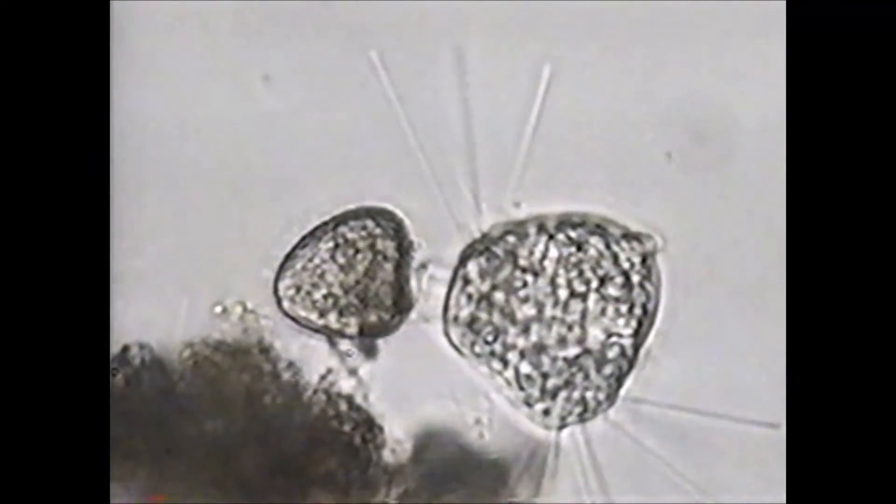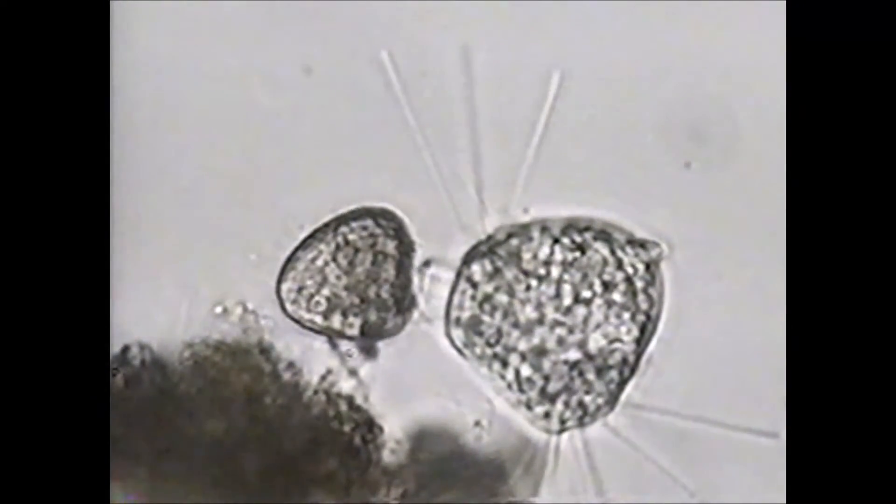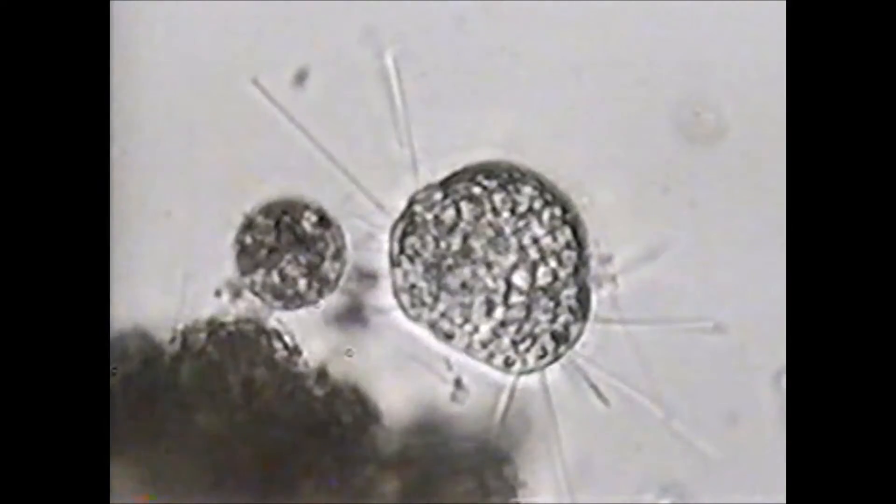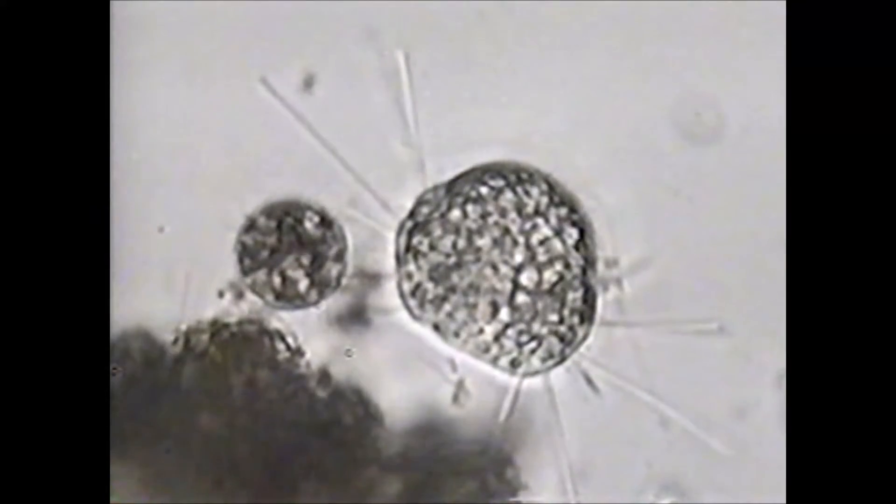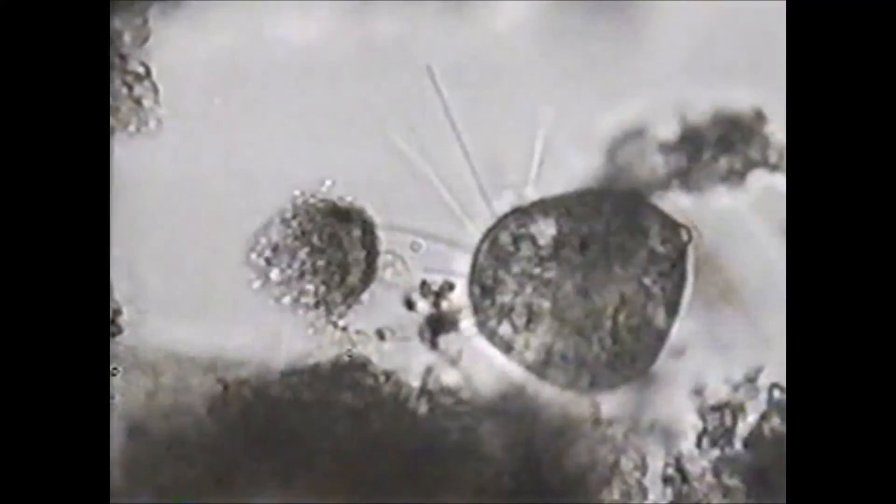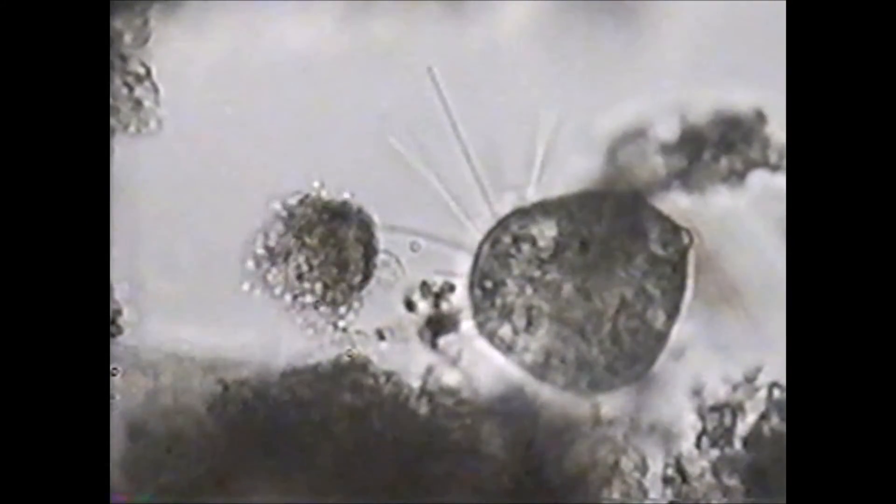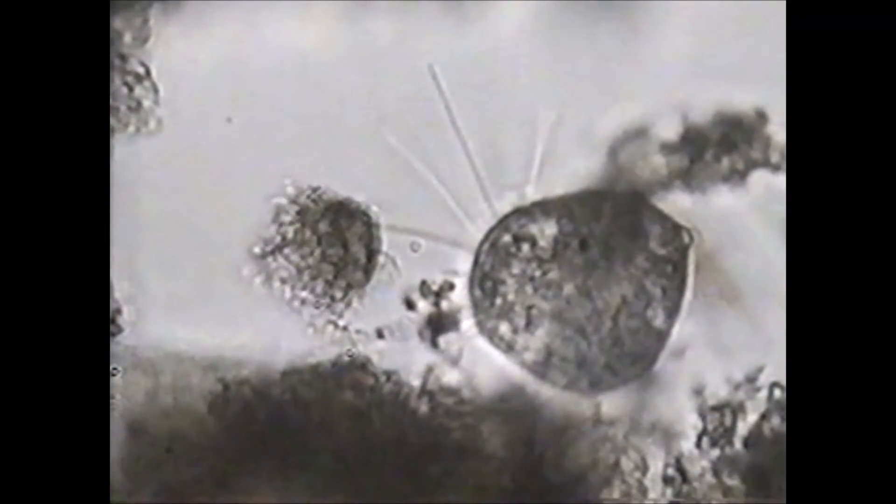The contents of the cell is transferred. The prey eventually disintegrates.